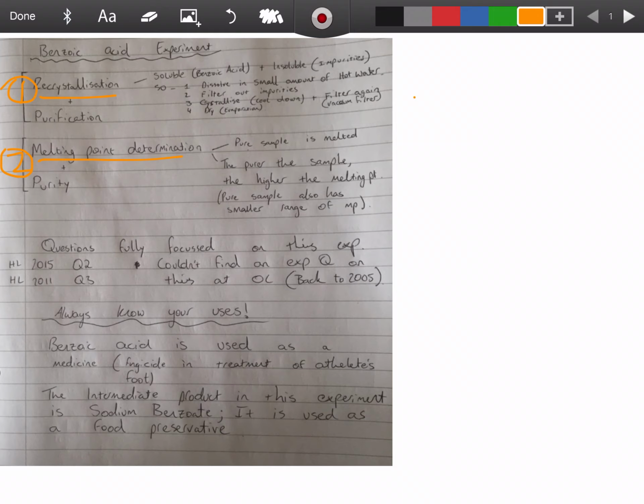We are recrystallizing the benzoic acid sample to purify it, to make it as pure as possible. Then with determining the melting point, you are essentially determining how pure the sample is. That's why I've split it into two parts, and why we're going to look at each part separately.